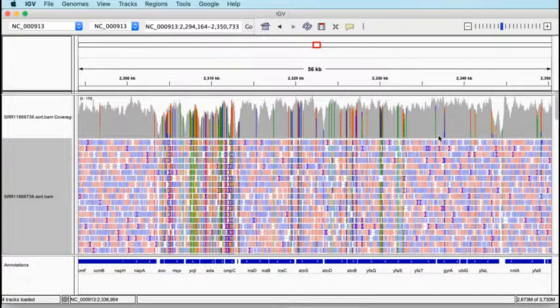So we're going to be doing variant calling, but I'm not going to be going into an awful lot of detail about really nuts and bolts variant calling, especially using human genomes and things like that at this point, because that's very, very involved. So we're going to be using BCF tools to call variation in this E. coli genome versus the K12 reference. So that's our task for next time around.